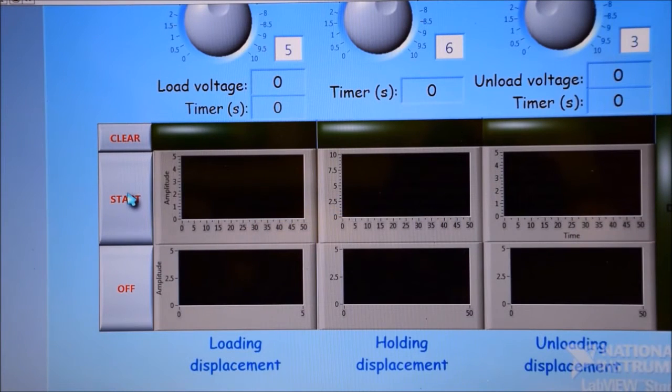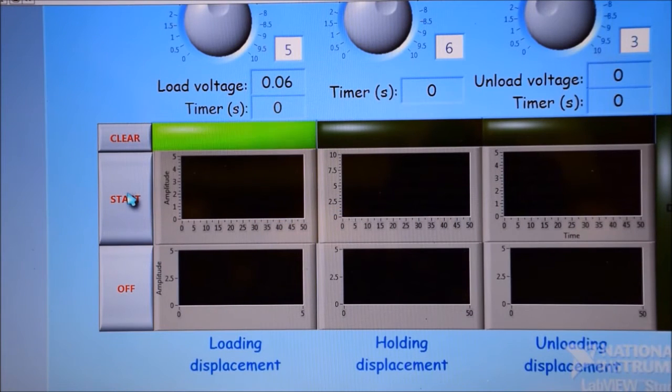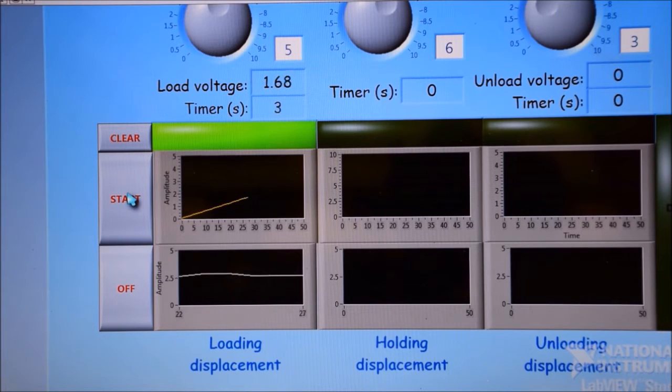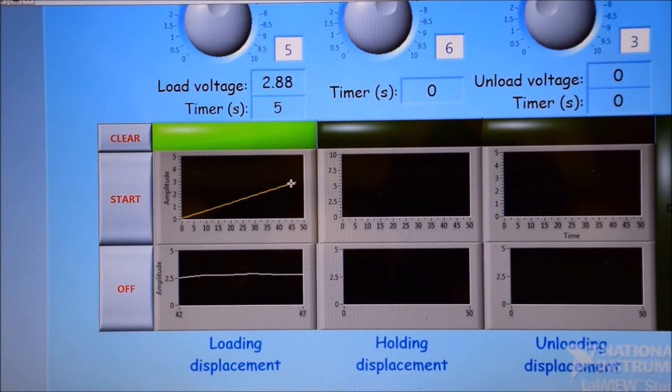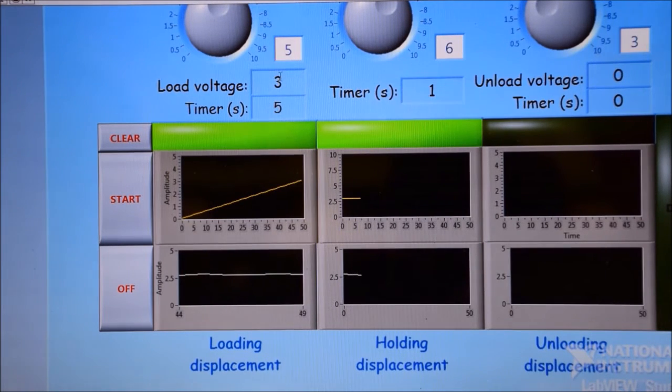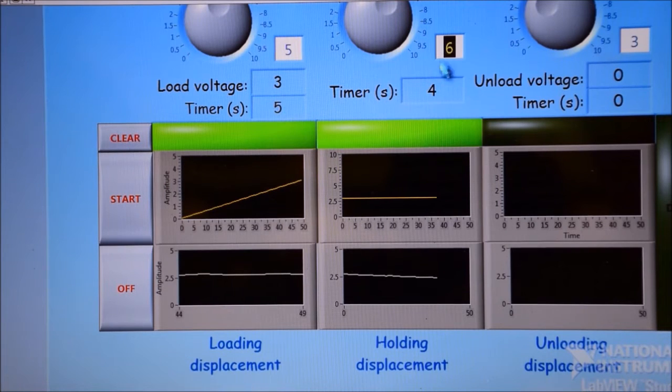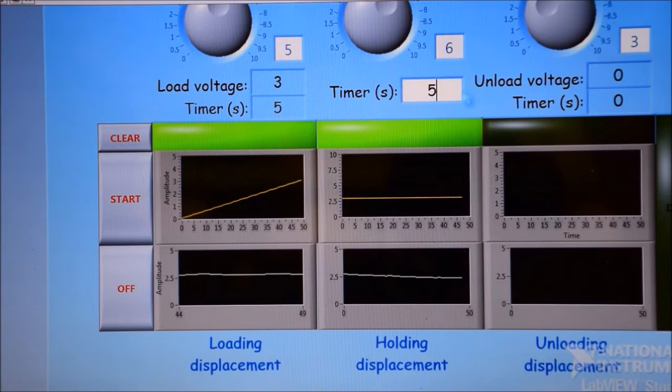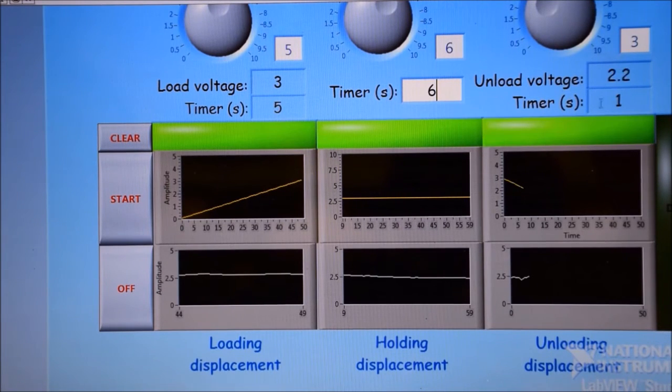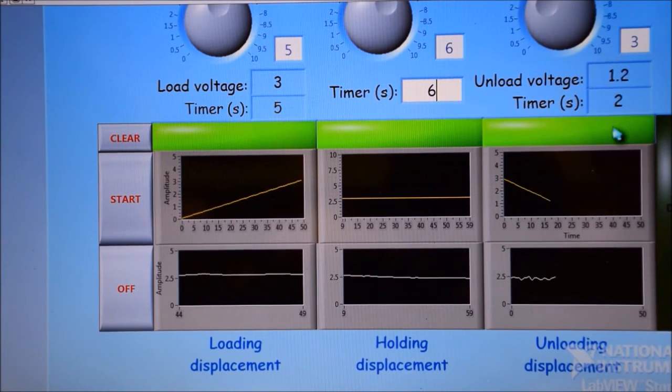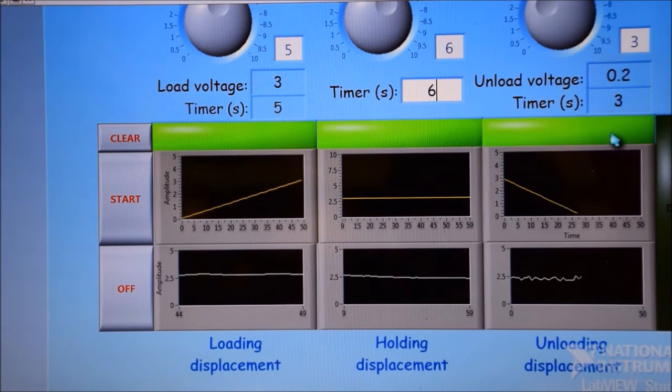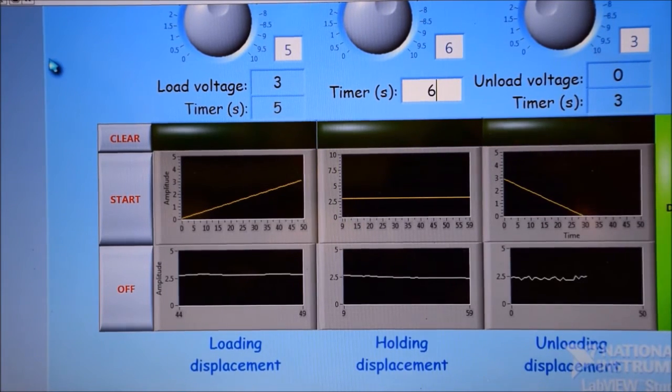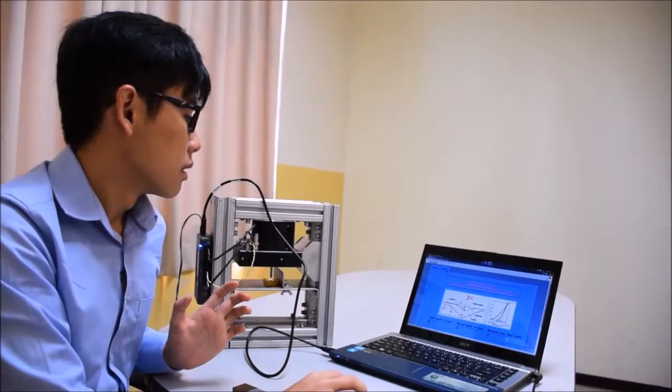So now we are going to run the software. The specification of the loading, holding, and even unloading time is set by the user, and here we are able to identify the displacement curve acquired from the indentation process.